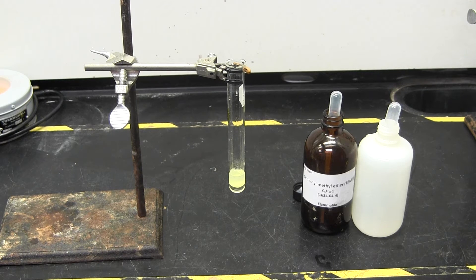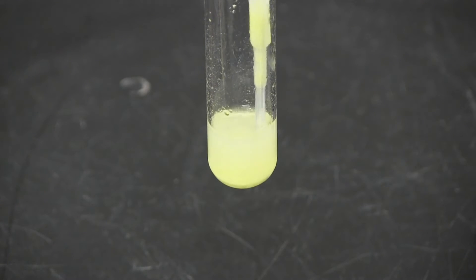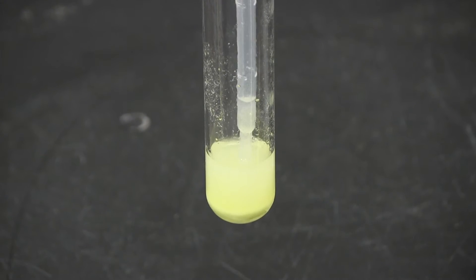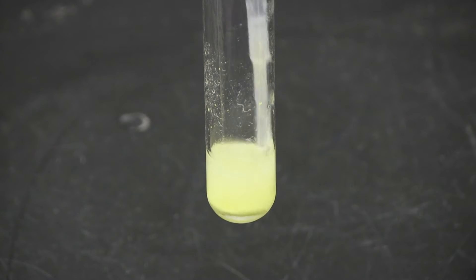The charged compound will move into the aqueous layer, while the neutral compound will move into the organic layer. Make sure you mix the two layers together to give the two compounds a chance to sort into the right layer. It is best to use a couple of small washes instead of one big wash.